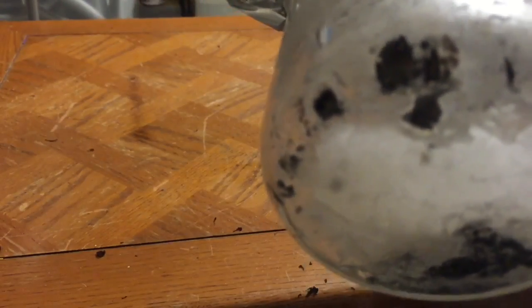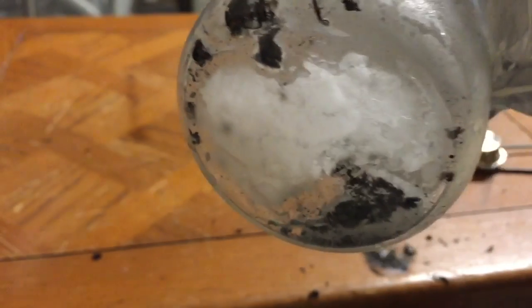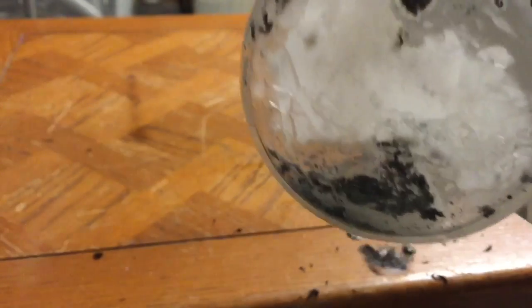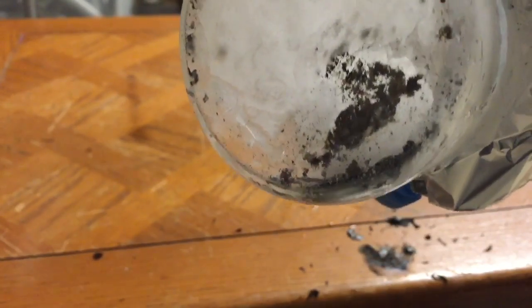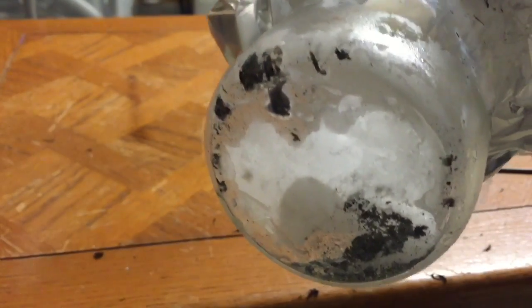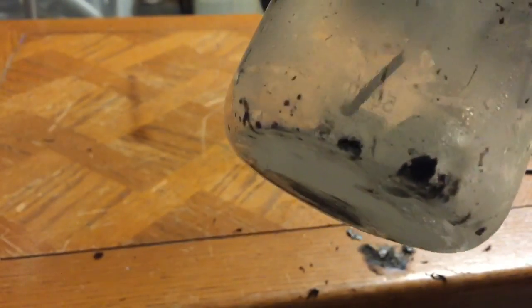At the end you can see this black residue left from where it burnt — this is carbon. Basically, the reaction is magnesium plus CO2 goes to magnesium oxide (MgO) plus carbon. The black stuff is the carbon generated from the reaction. As you can see, magnesium burns a whole lot better in CO2 than it does in oxygen, so you have to think twice before putting out a magnesium fire with a CO2 fire extinguisher.